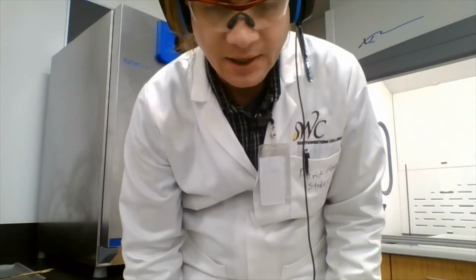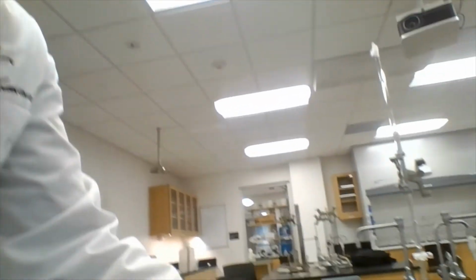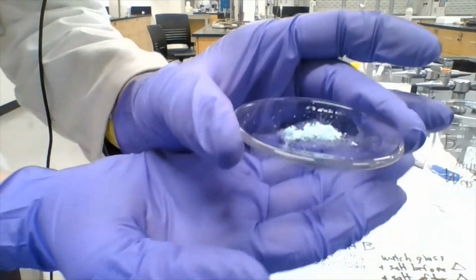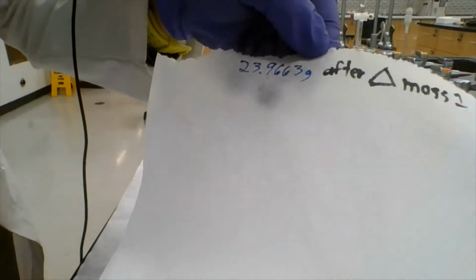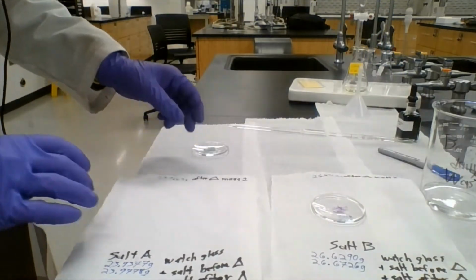Okay, just a few minutes have passed. They've cooled to room temperature, and here we are. Salt A looks to me like a slightly lighter shade of whatever it was before, I think pink. And there is the new mass.